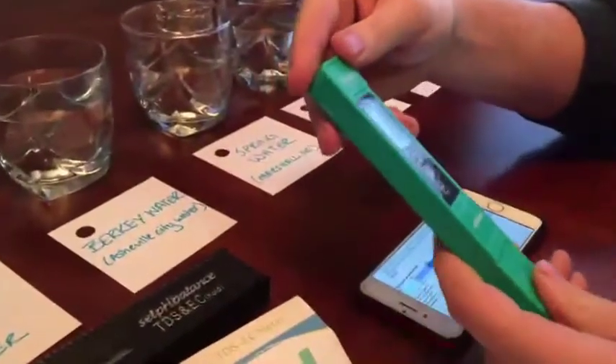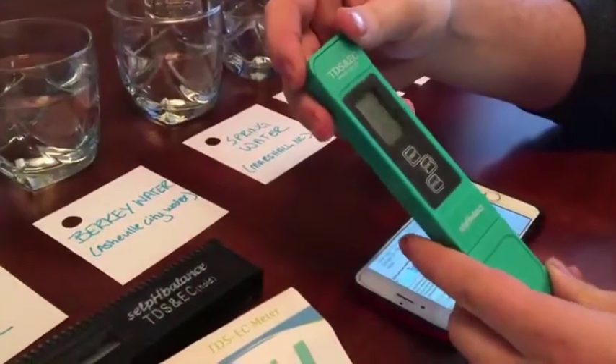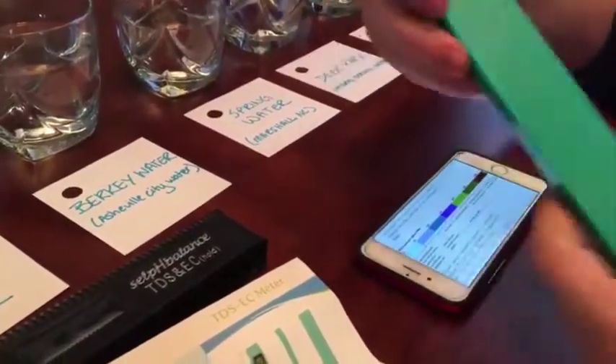This is the selpHbalance pH, TDS, and conductivity meter — it's a pretty nifty tool. I've never used it before, so I'm just showing you how it works and that it's effective.